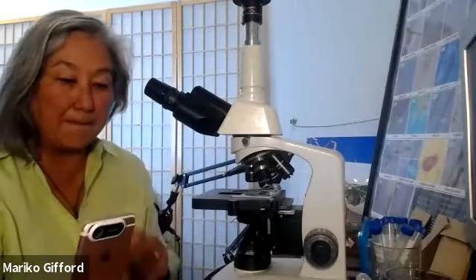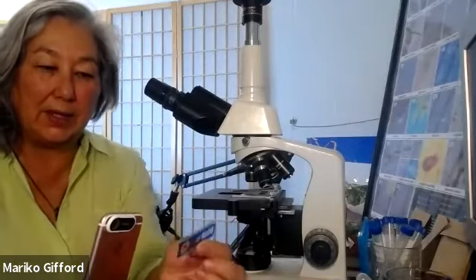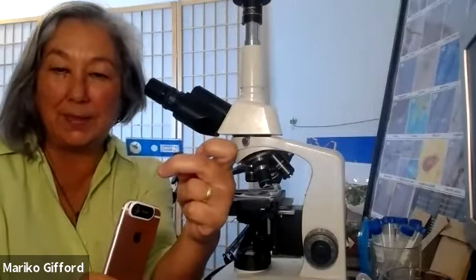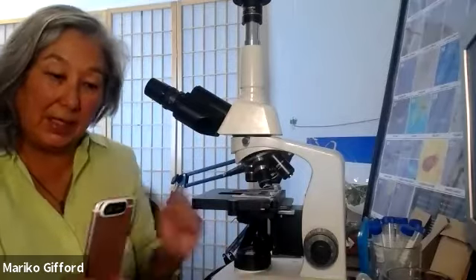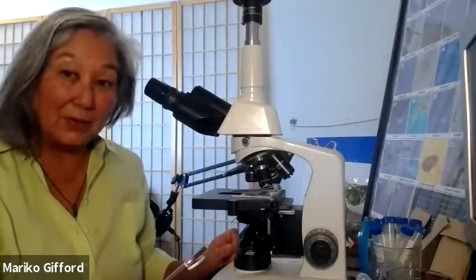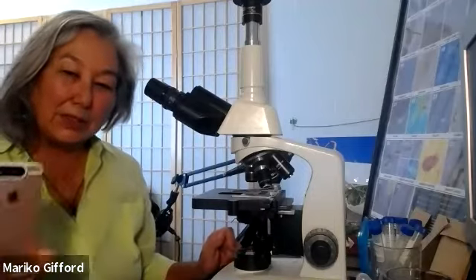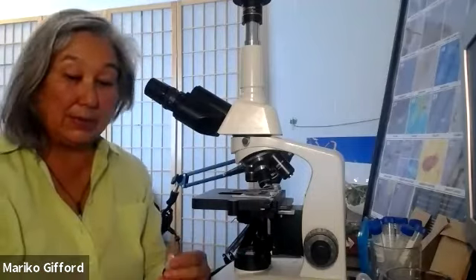You can make a slide. I mean, this thing comes with a little slide, this is like a pre-made slide, so you can hold this right up to it and look at it. But you can make up a slide, and you can put this right over that slide, and you can look at what's in that slide. It's amazing, right? So just so you know that there are some amazing tools out there.